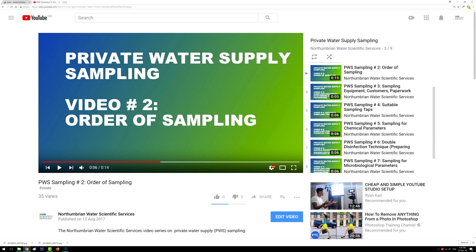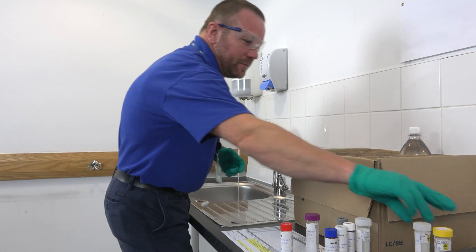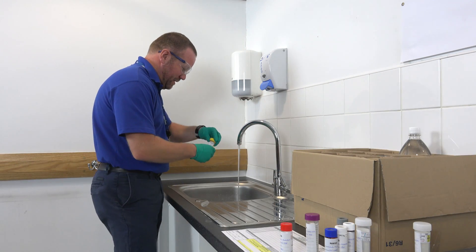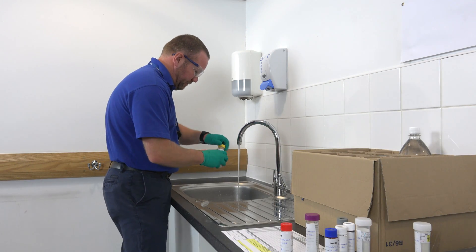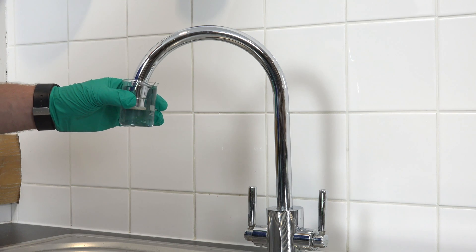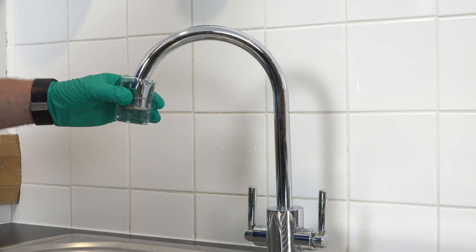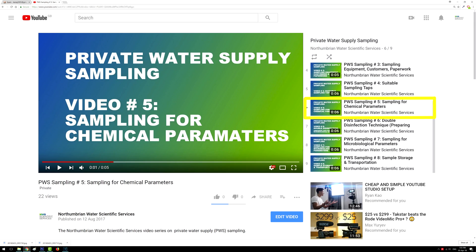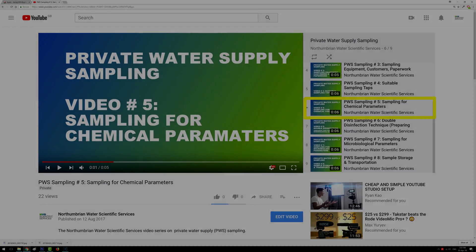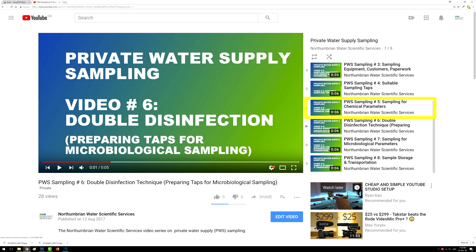Firstly, you'll need to ensure that you take your samples in the correct order. We've previously explored how important this is in video number 2, which is dedicated to the order of sampling. Before proceeding with microbiological sampling, you need to have completed all required chemistry sampling and to have thoroughly disinfected the sampling tap. Chemistry sampling is covered in video number 5, and tap disinfection techniques are covered in video number 6.